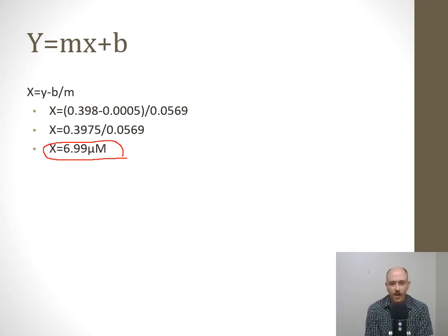So if you set up your equation of the line properly, you can plug these in and answer them very rapidly and convert them. You can't just convert your averages. You have to convert all your data to micromolar and then do your averages and then make a graph based on your data from this lab. And the data is provided on the lab website.